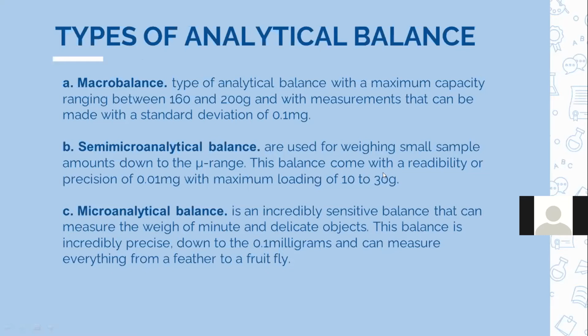For microanalytical balance, it is an incredibly sensitive balance that can measure the weight of minute and delicate objects. This balance is incredibly precise, down to 0.1 milligrams, and can measure everything from a feather to a fruit fly. Next.